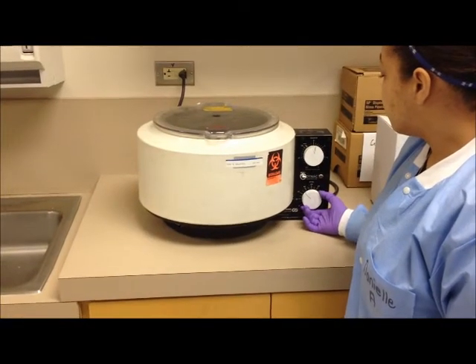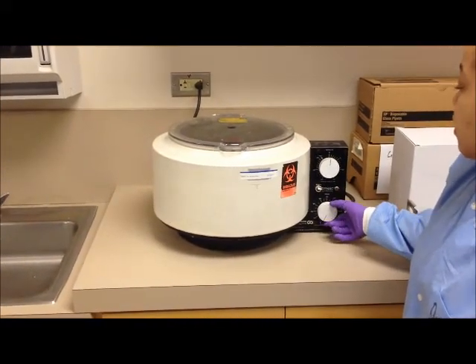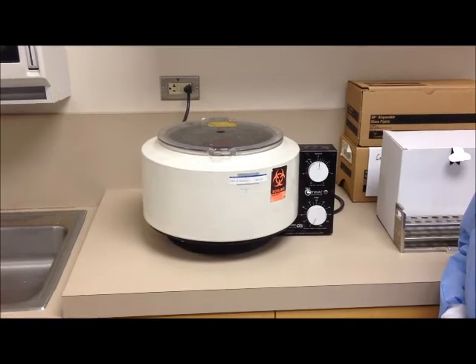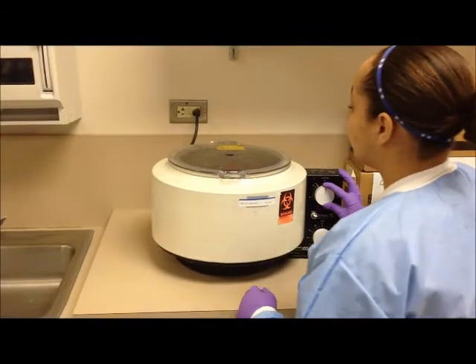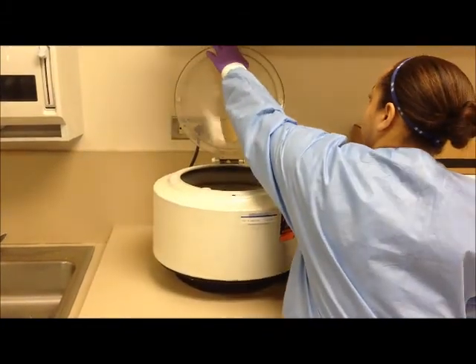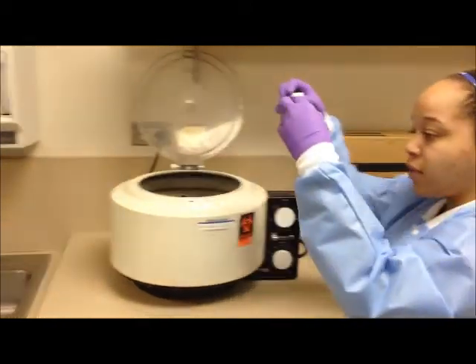Specimens should be removed and any spills cleaned immediately with 5% hypochlorite. Now the timer has gone off and here's Danielle turning down the speed dial, letting the centrifuge coast to a stop. Now she's opening the lid and taking a look at the specimens.